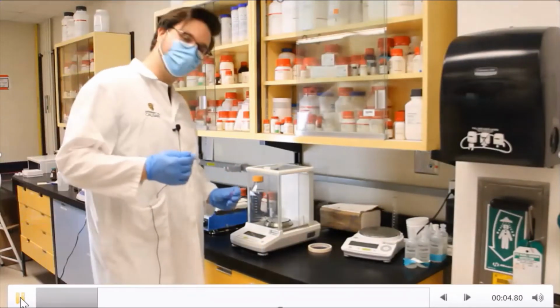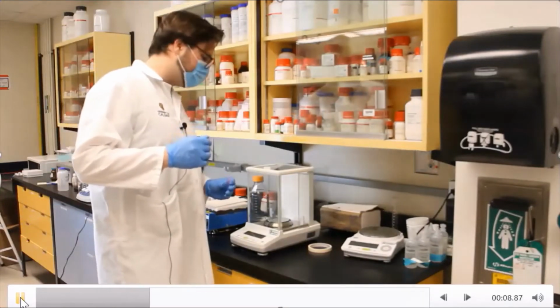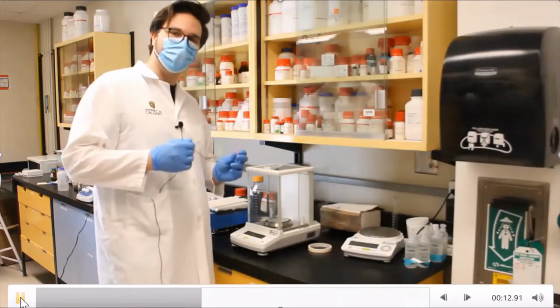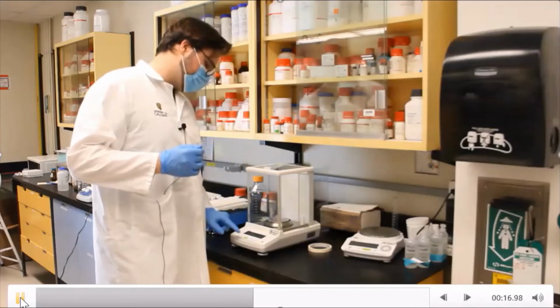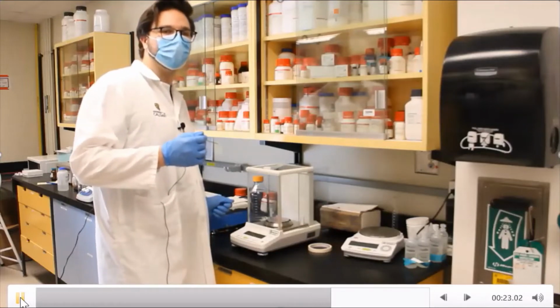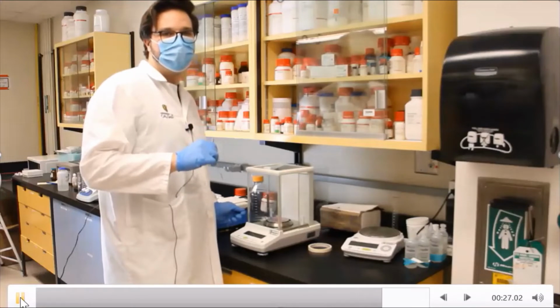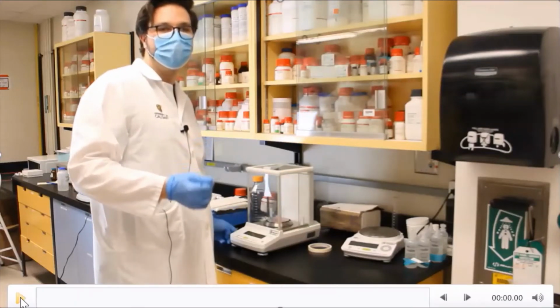Here we're making the standards for the calibration curve. Due to the low mass of the product that we need in our calibration, we're going to be using this small Eppendorf tube directly in our weighing scale. We're going to put it on, zero it, and then take our product, weigh it out as close as we can to our calculated masses, and then go back and adjust our dilution to make the proper volume and concentration that we need for our standard curve.